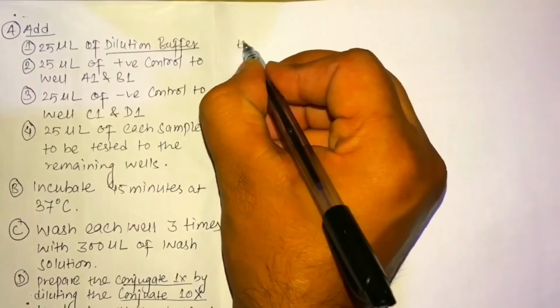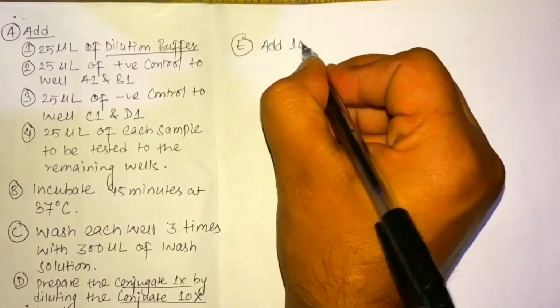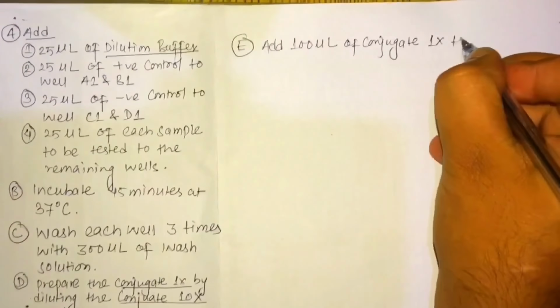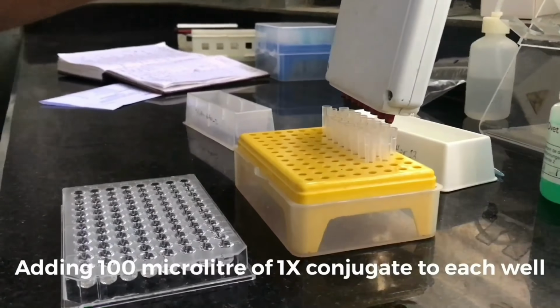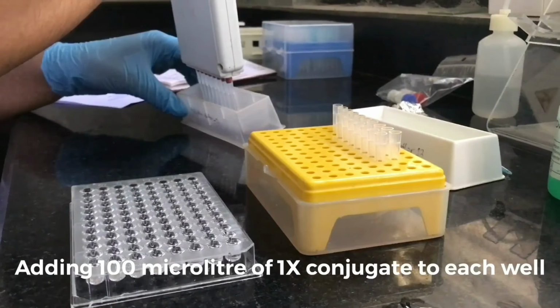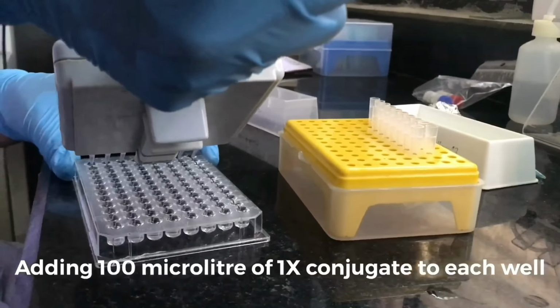Now we will add 100 microliter of 1x conjugate to each well. Just like this, we will be using the multi-channel micropipette, with the prepared 1x conjugate of 10x dilution.